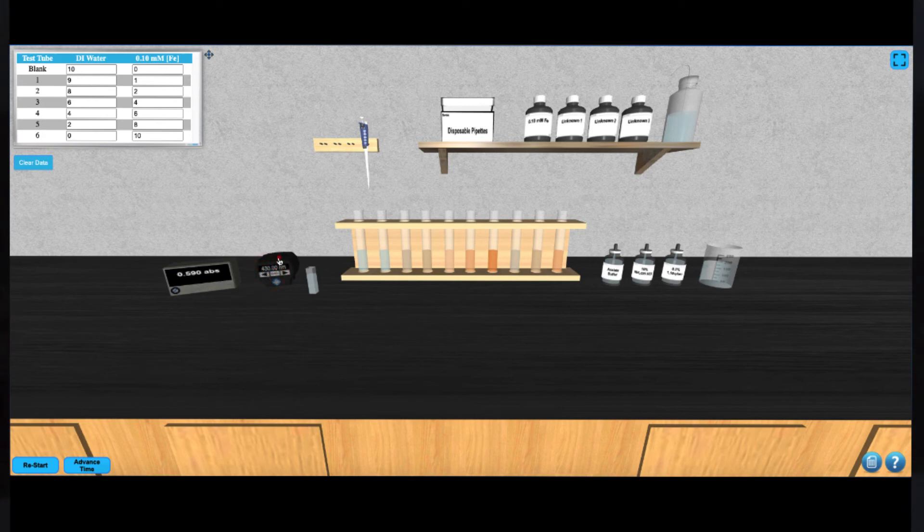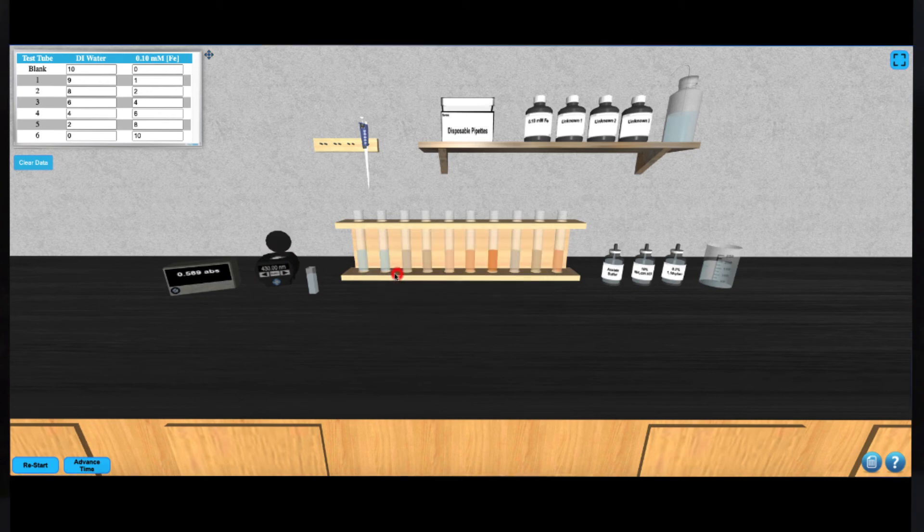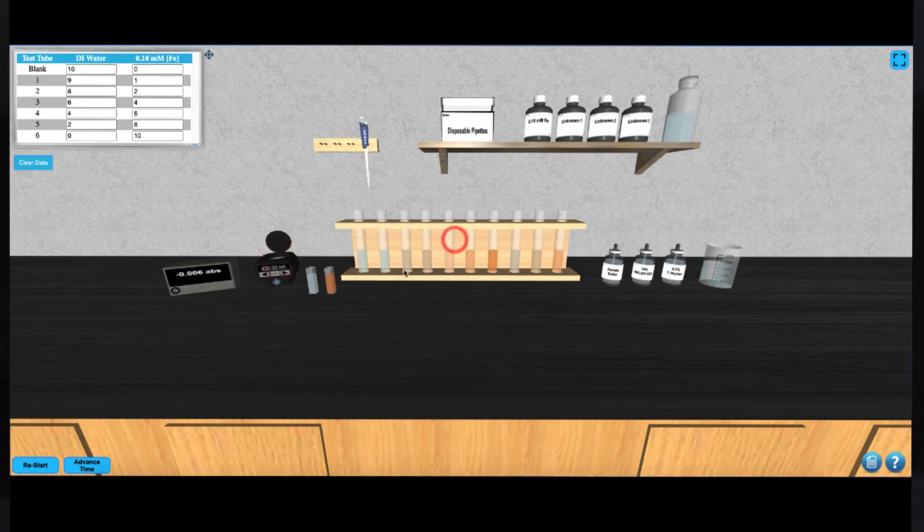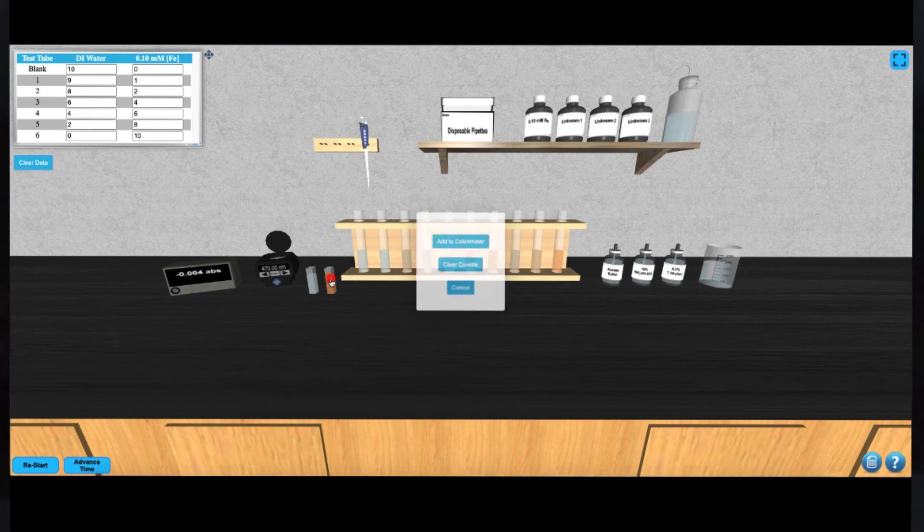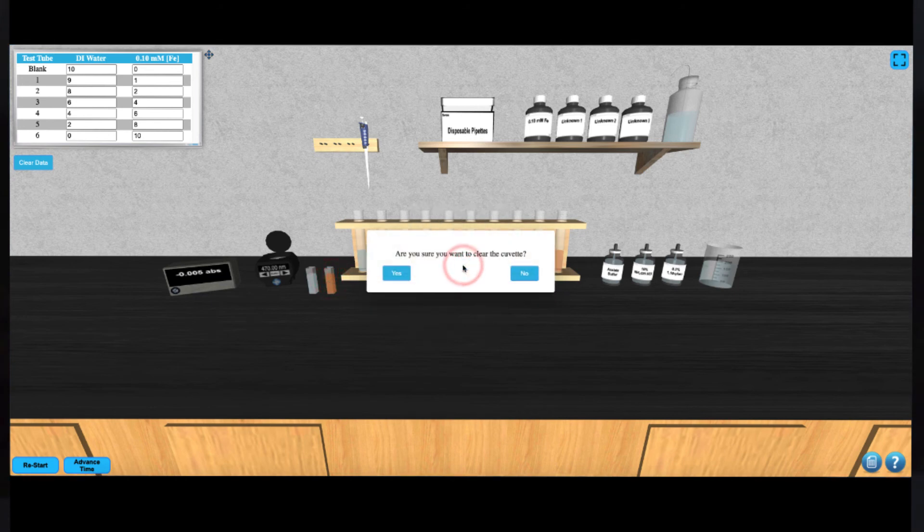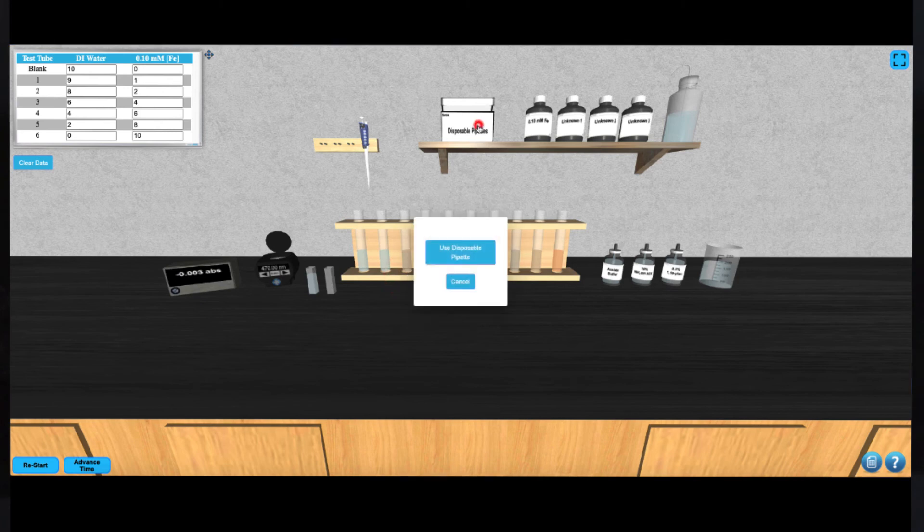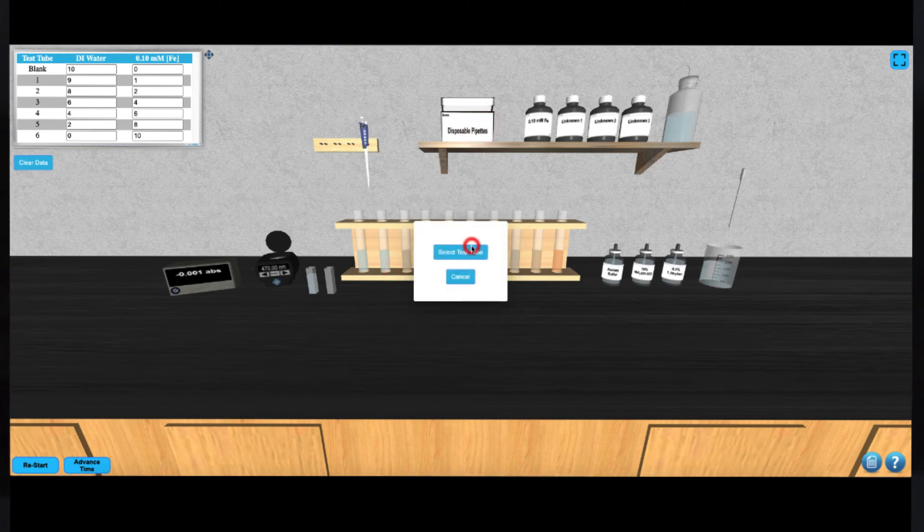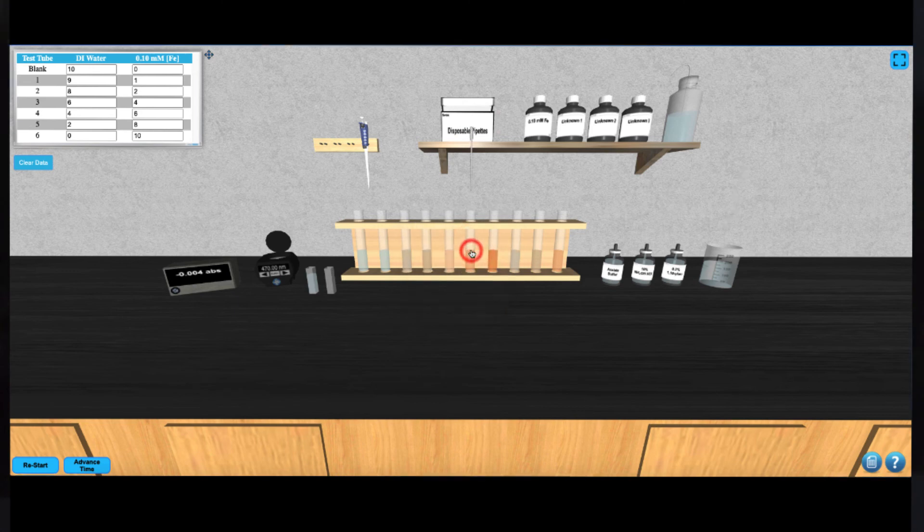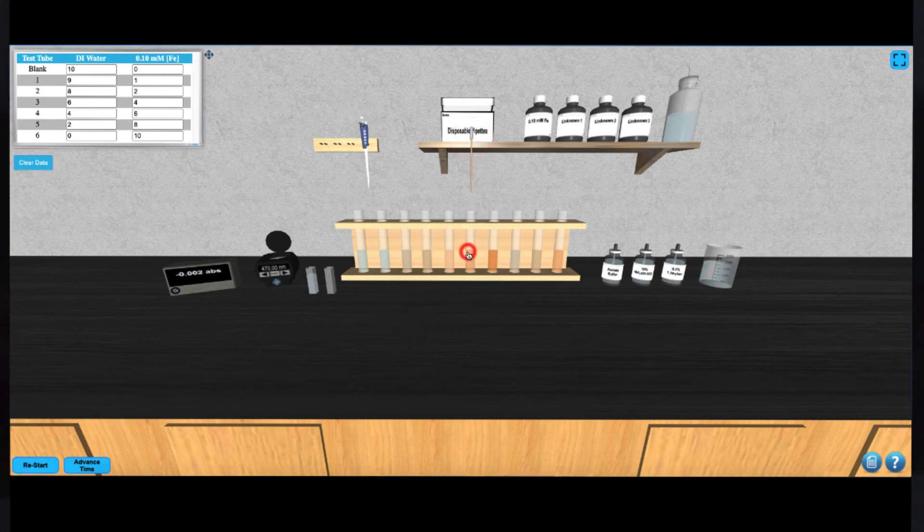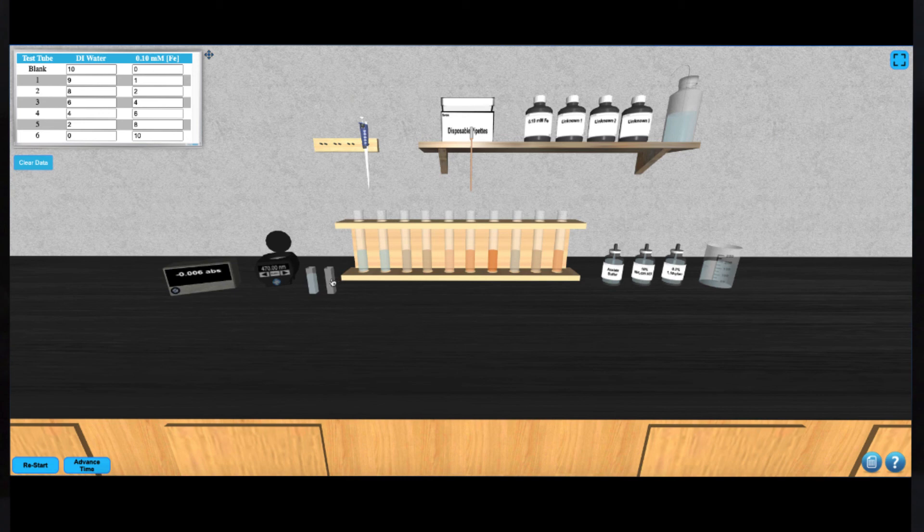To construct your calibration curve, you'll need to record the absorbance of each of your standard solutions. Empty the second cuvette by clicking on it and then select a disposable pipette from the shelf to draw up the next solution from its test tube. Place that solution in the cuvette by clicking on it and insert into the colorimeter to take your next absorbance reading.